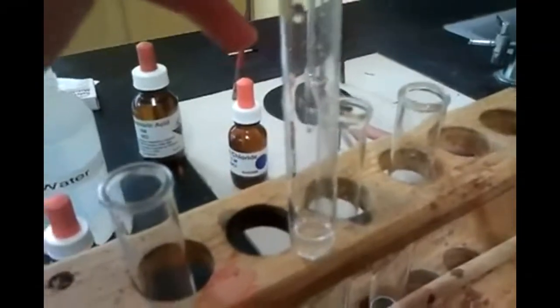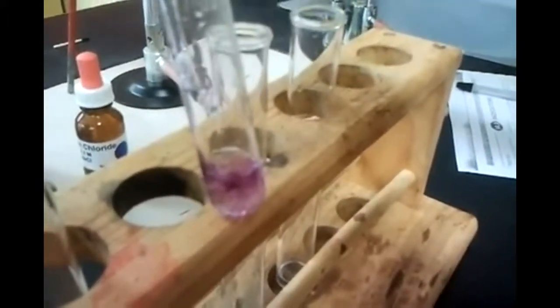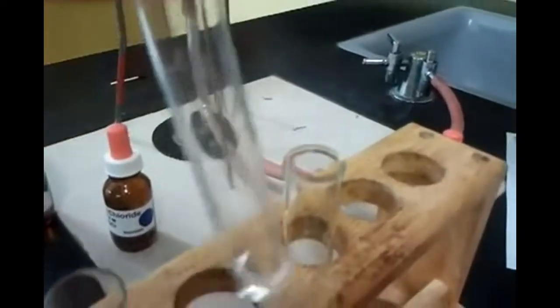This is sodium chloride — a salt. We're putting in that purpley litmus solution and it should turn purple as well. It's purple. Next is hydrochloric acid — it's an acid. And it's turning... red! Red acid.